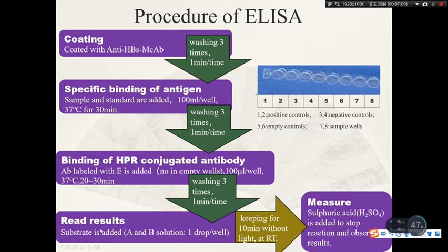Next, we need to read the result. First, we add the substrate to the wells and then keep in the dark for 10 minutes at room temperature. After 10 minutes, we add stop solution, and then measure the result. Next, I will show you how to do the test.